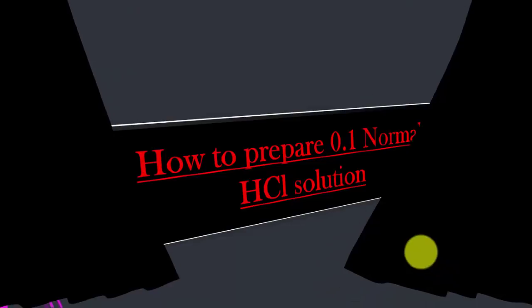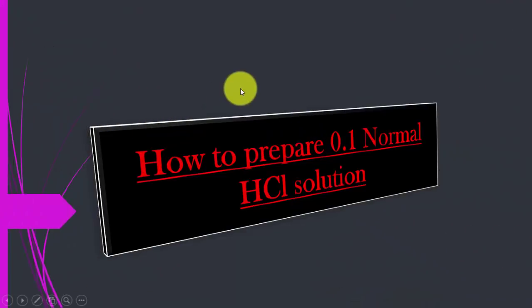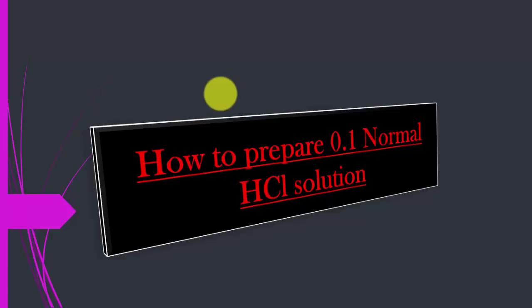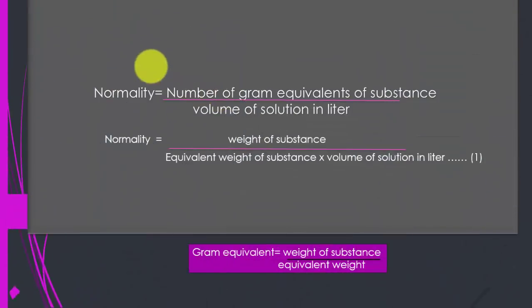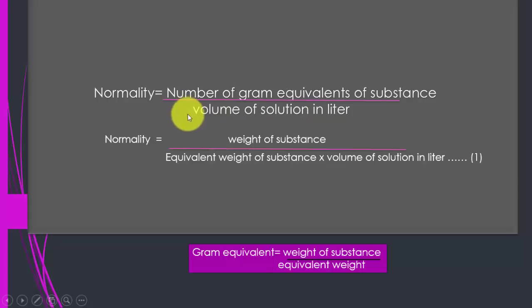Hi dears, today I will show you how to prepare a 0.1 normal HCl solution. So let's proceed to see how a 0.1 normal solution can be prepared.